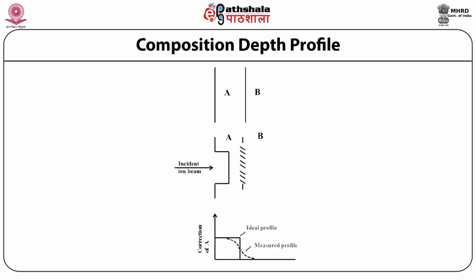The atoms are ejected from the surface of the sample by bombarding ion beams, and by rastering ion beams directed at the surface, a crater develops. A profile of the compositions at the surface and near the surface could be known by examining the evolution of the AES and XPS spectra acquired through the crater at different depths.